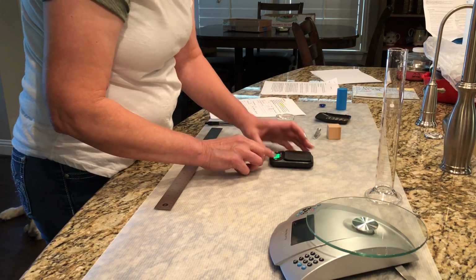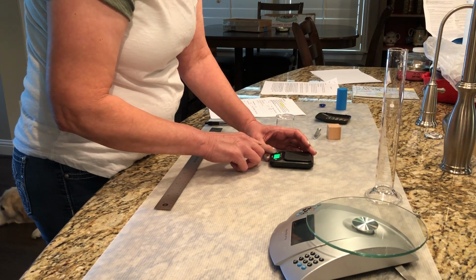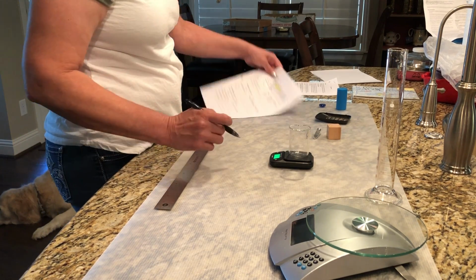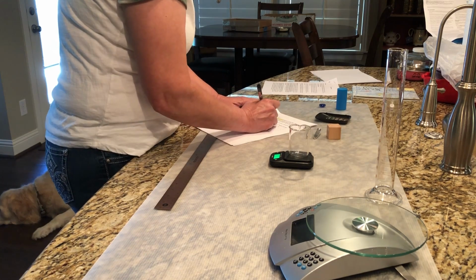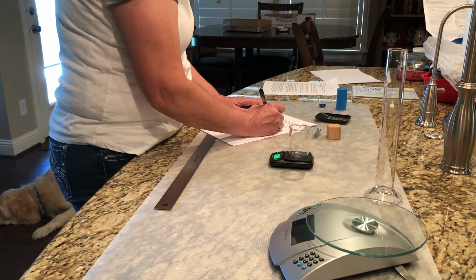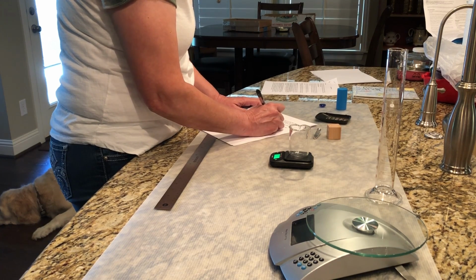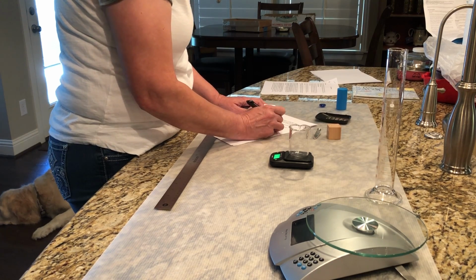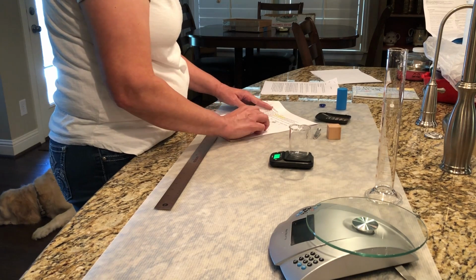Oops, let's get to the right section. Tare it. 50 ml beaker comes out to 35.94. So 35.94, estimated digit would be the 4, and the number of significant digits would be 4.